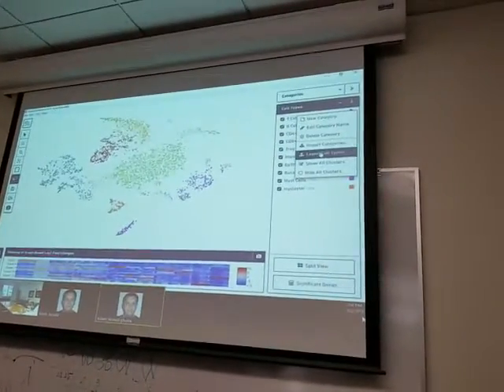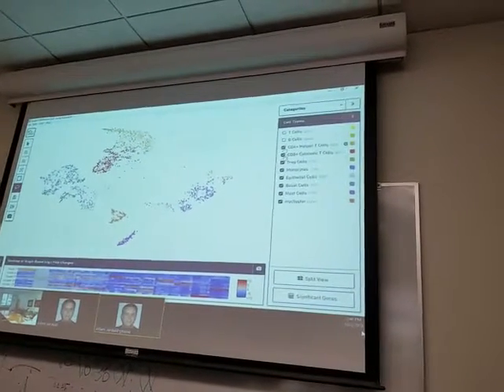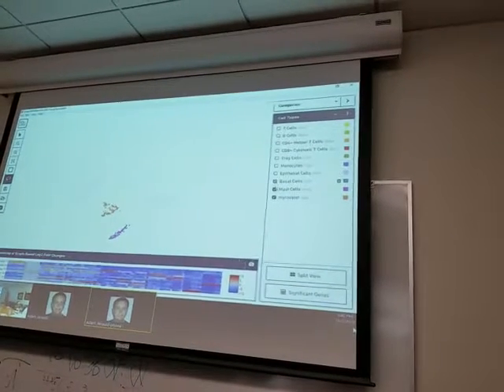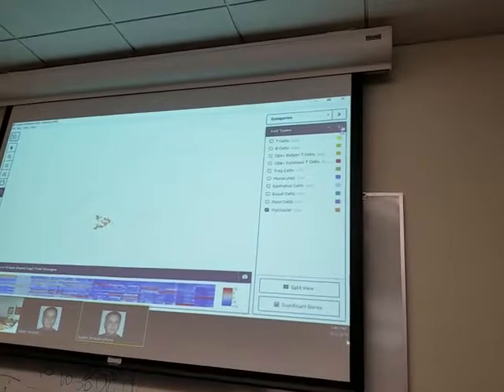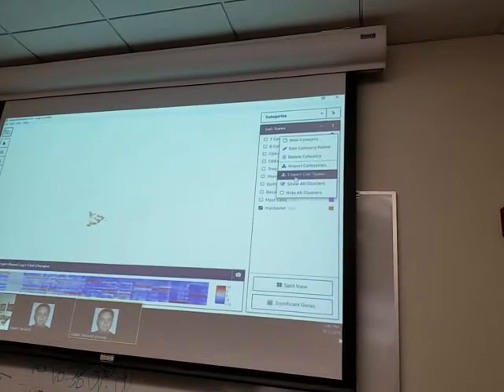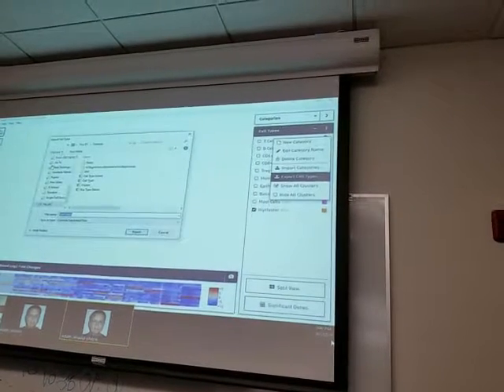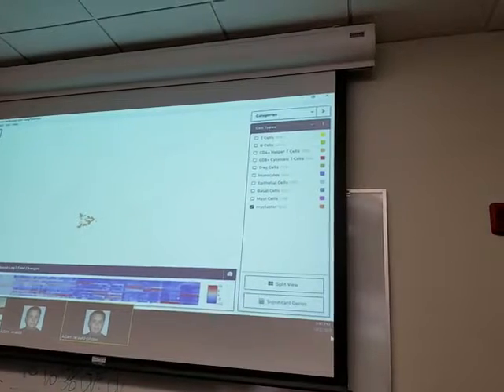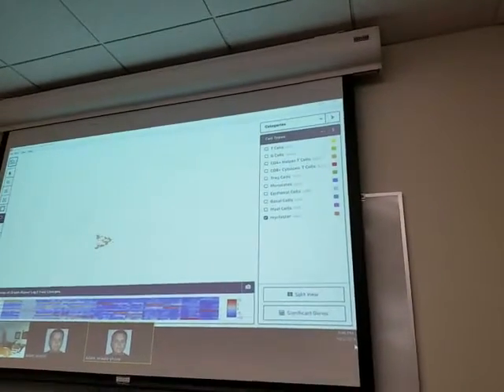And then export. Now in this case, there's a bunch of other stuff, so turn those off. That's because someone else has annotated everything else. In our little scenario, we had only annotated one of them, so we would just export that, and exclude unlabeled, so you just get the ones. And what does that now look like, the little exported file? I always forget where it goes.